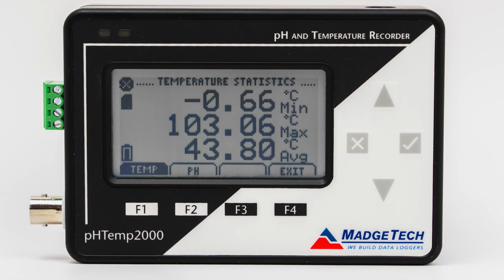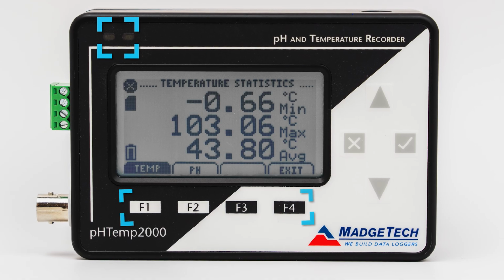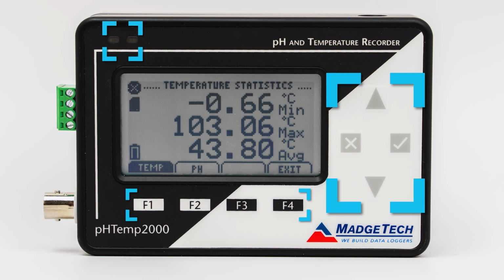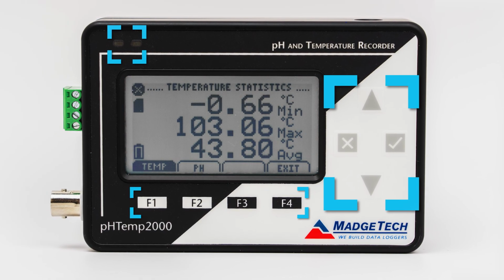The front face of the pHTemp2000 is where you'll find the LED indicator lights, function keys, navigation keys to help fine-tune the data logging settings, as well as a backlit LCD screen to display real-time data.